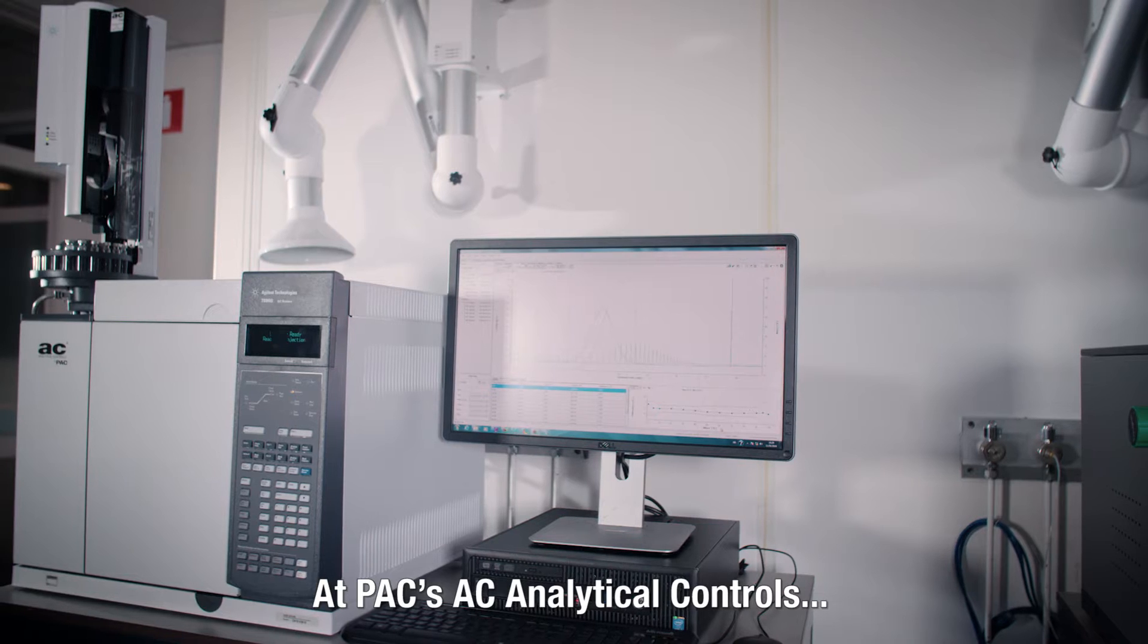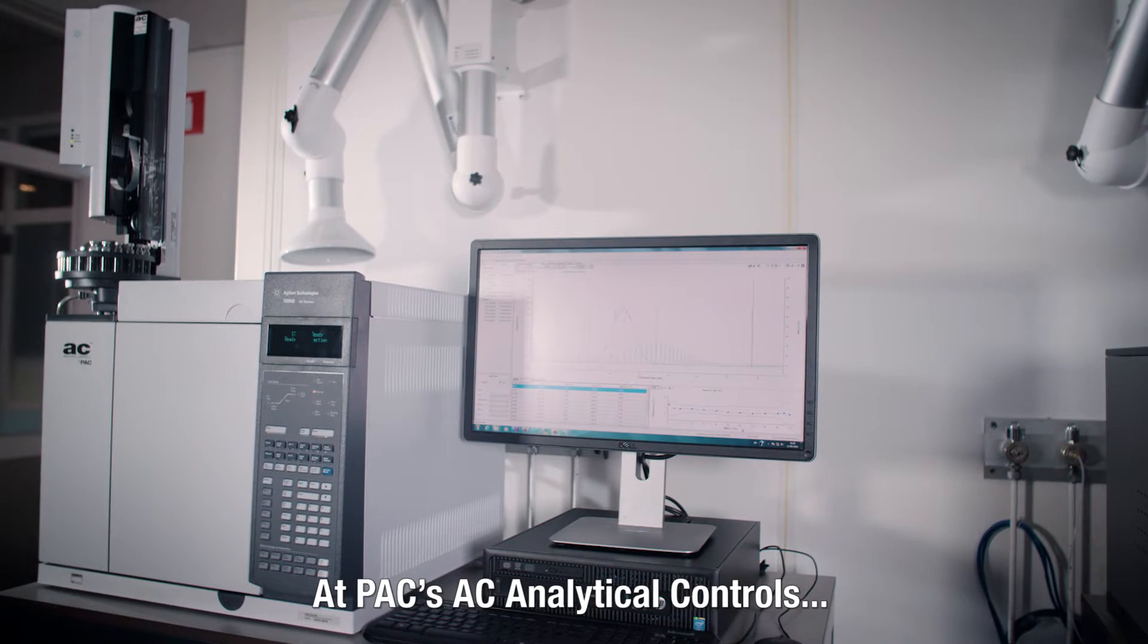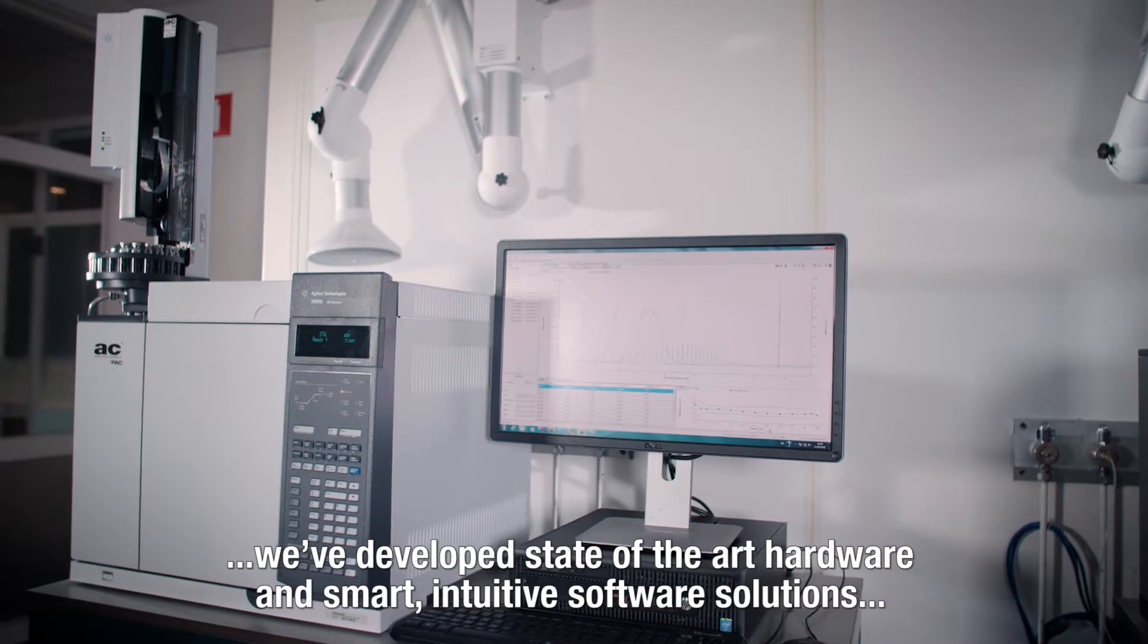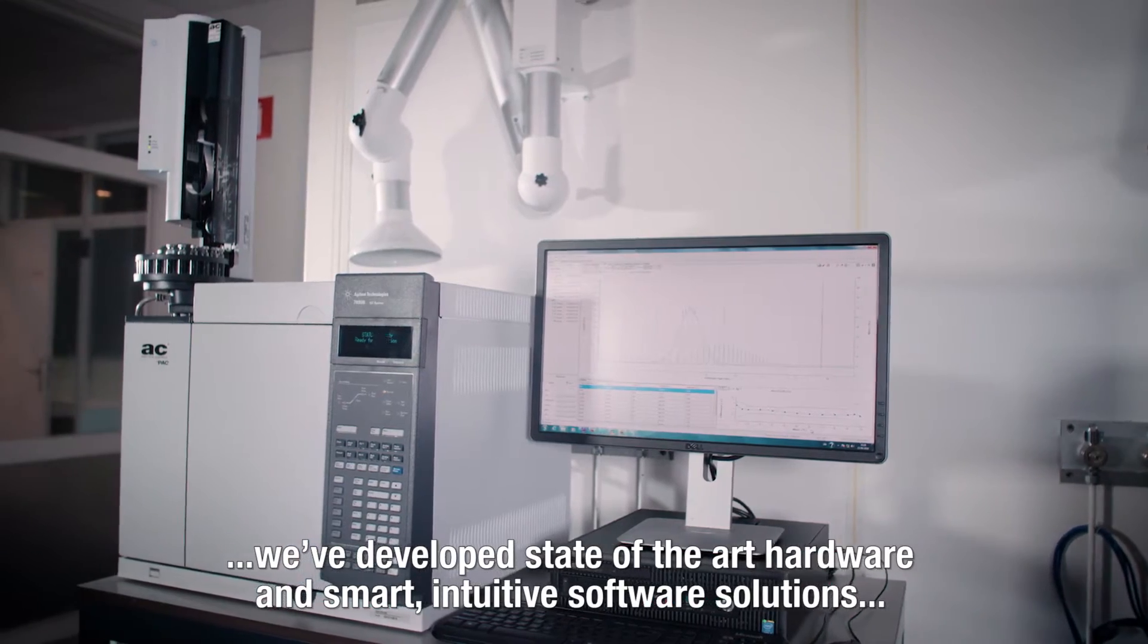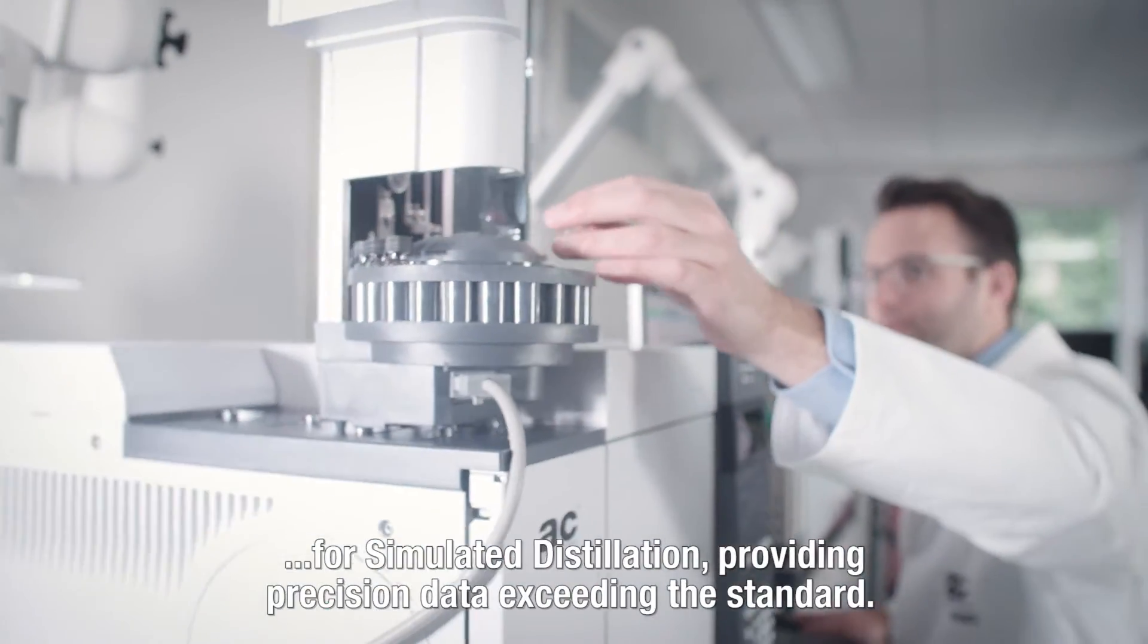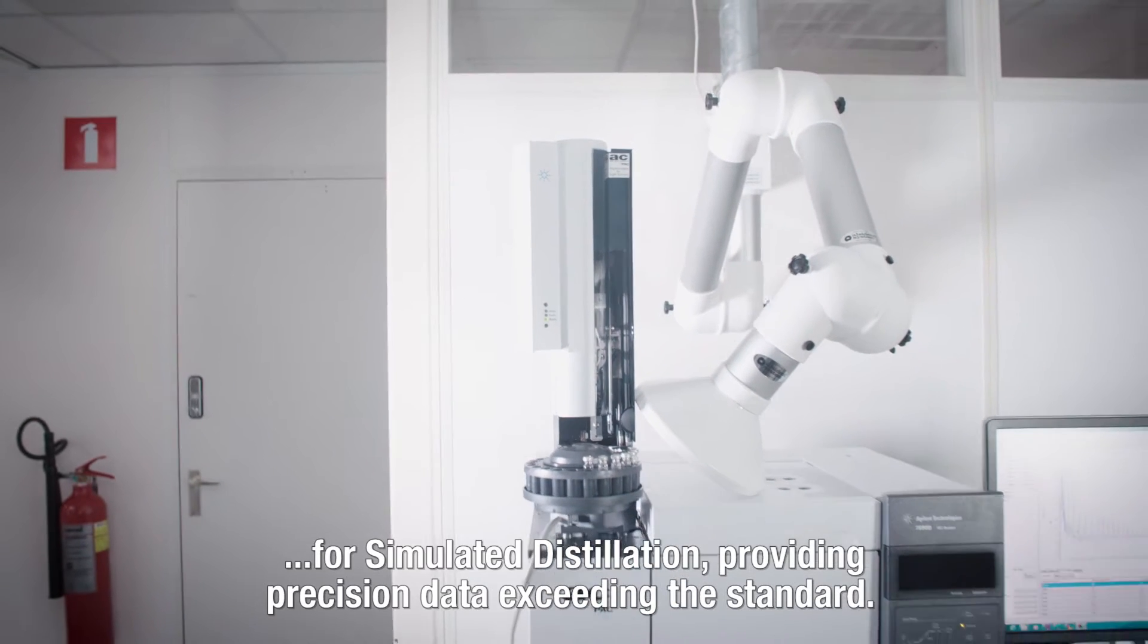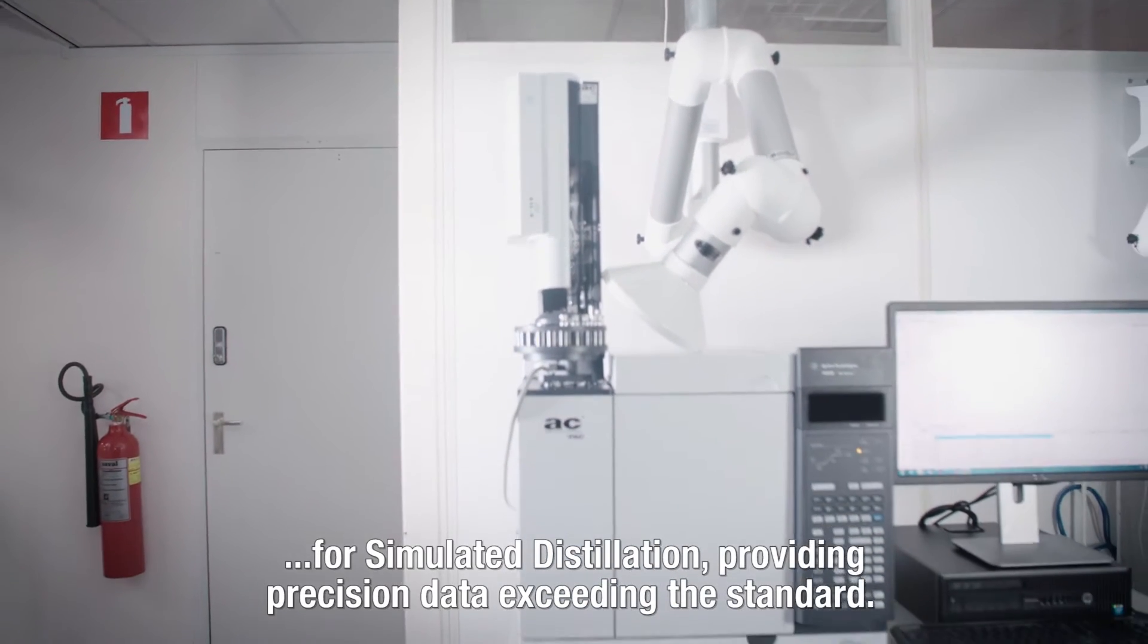At PAC's AC Analytical Controls, we've developed state-of-the-art hardware and smart, intuitive software solutions for simulated distillation, providing precision data exceeding the standard.